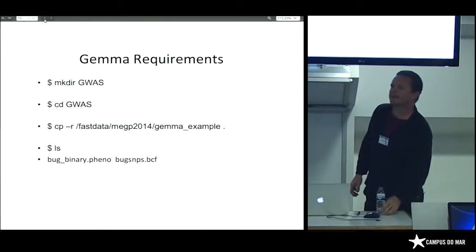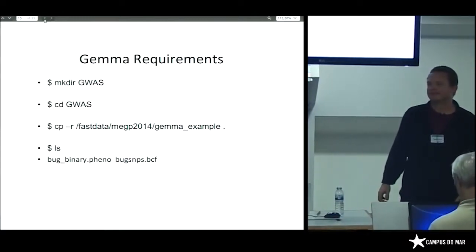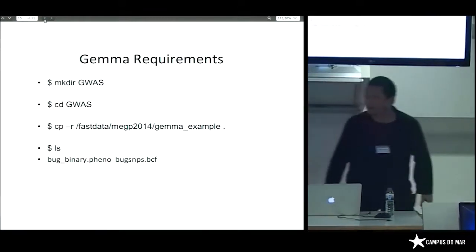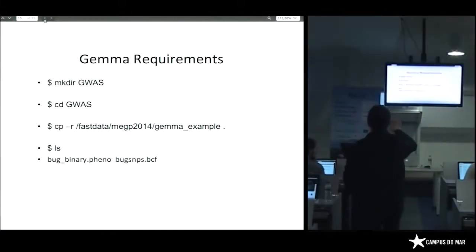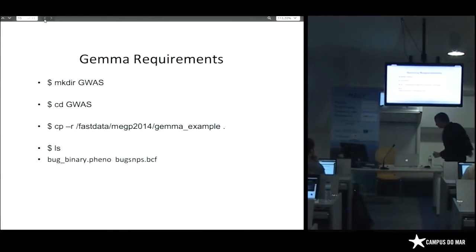Put your hand up if you need help. Put your hand up if you'd like to see the giraffe cartoon again. I don't know how to make that happen. You can download the PDF yourself though. So change directory into your folder called GEMMA example.